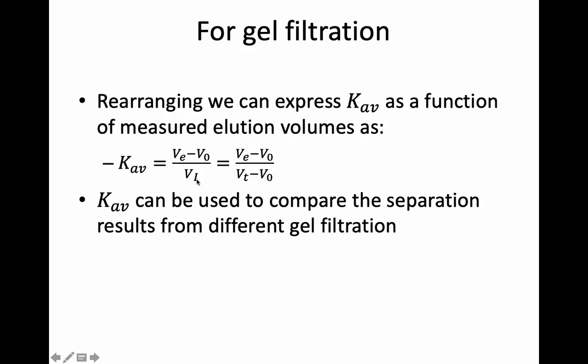So we can perform an experiment, measure these quantities from your gel filtration analysis, and estimate KAV.